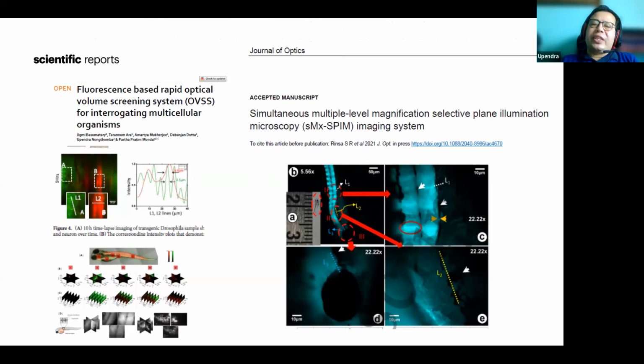If you remove the fat cells, then the muscles will not develop at all. So muscle development is based on the fat cells and the neurons, and how they crosstalk. This is what exactly excites us, and this we have studied extensively with light microscopy at the moment.